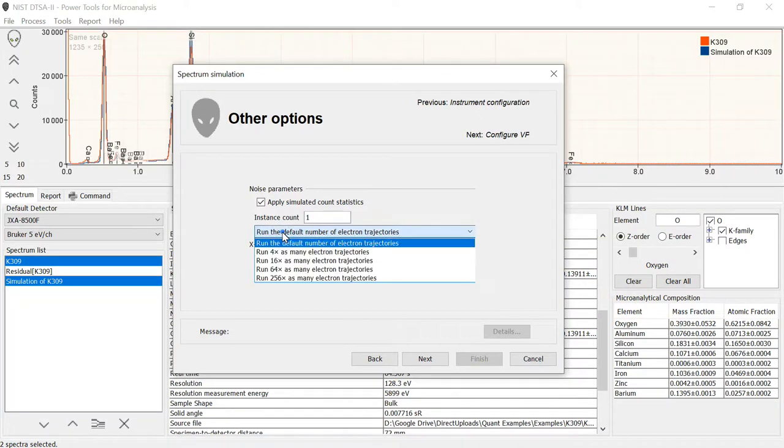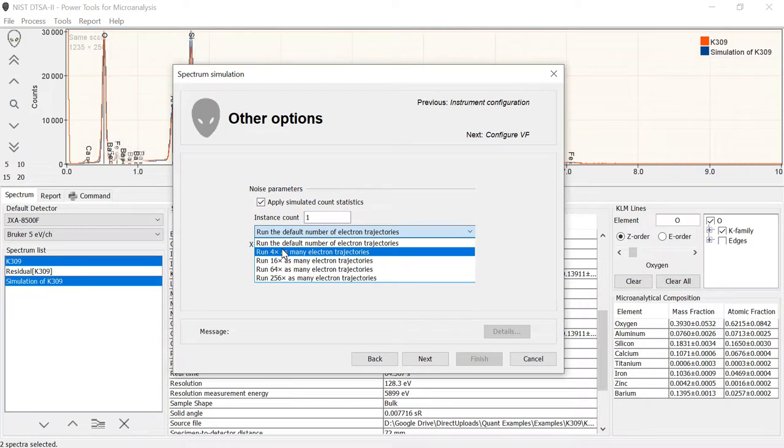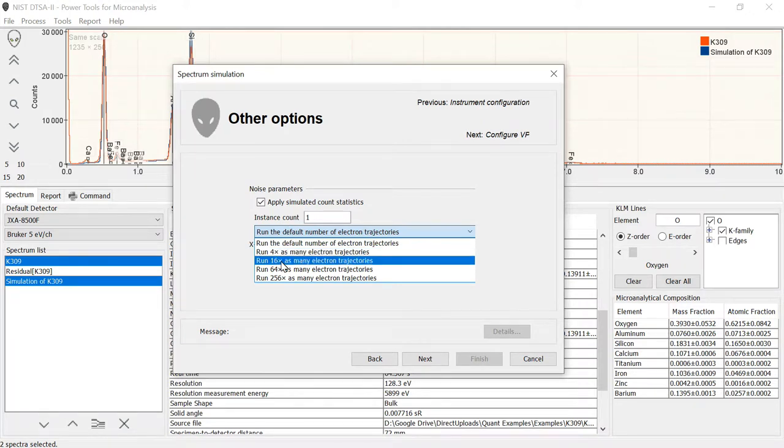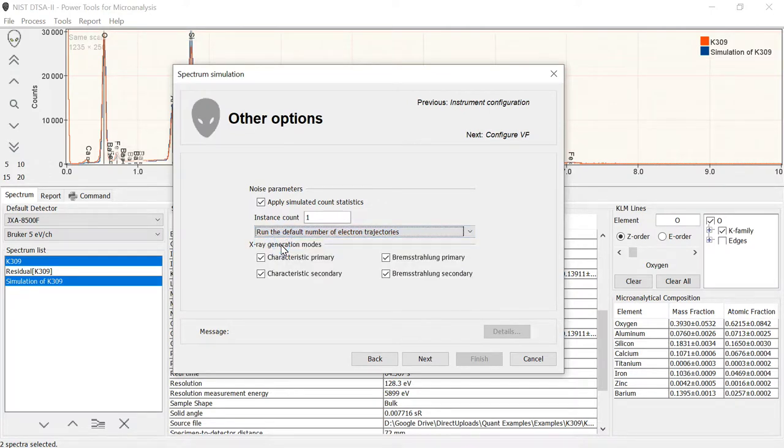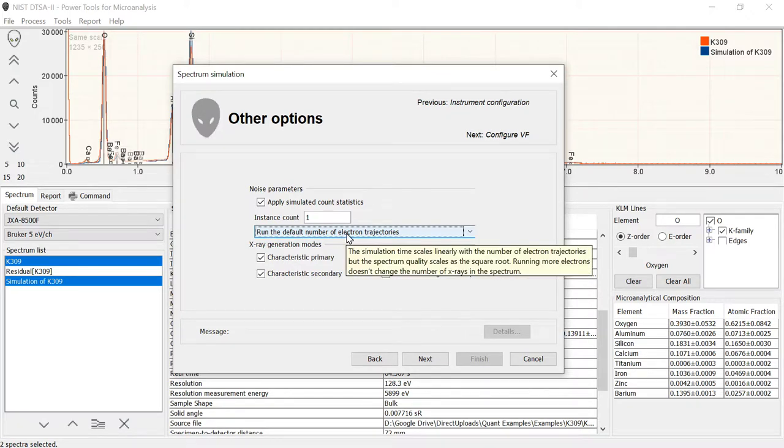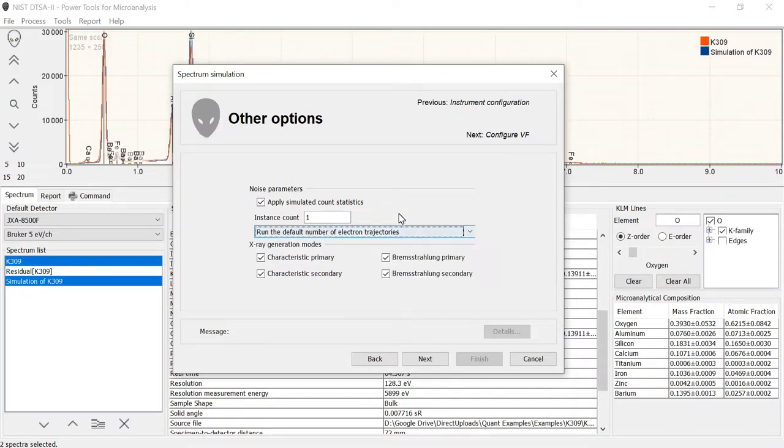If I select 4 times that, I cut it by a factor of 2. If I select 16, I cut that by a factor of 4, so about down to a quarter percent. But they take much longer to run. Running the default number of electron trajectories means the simulation runs in about a minute, plus or minus.